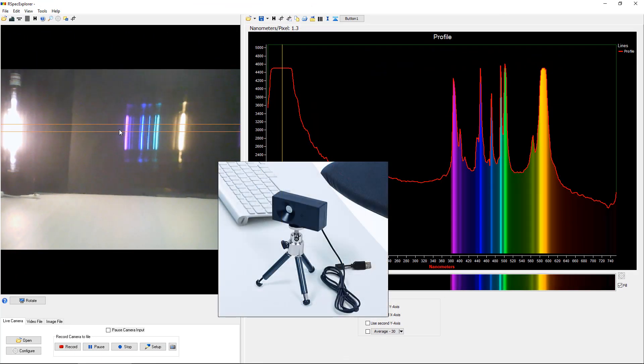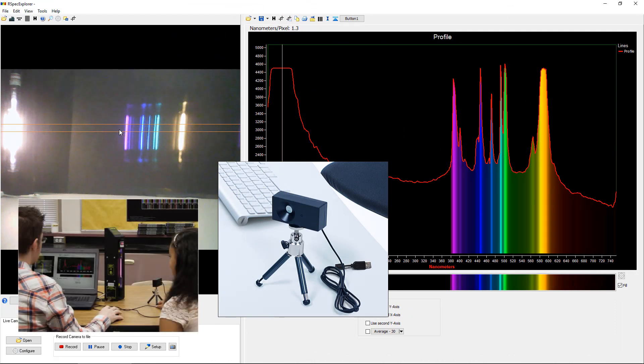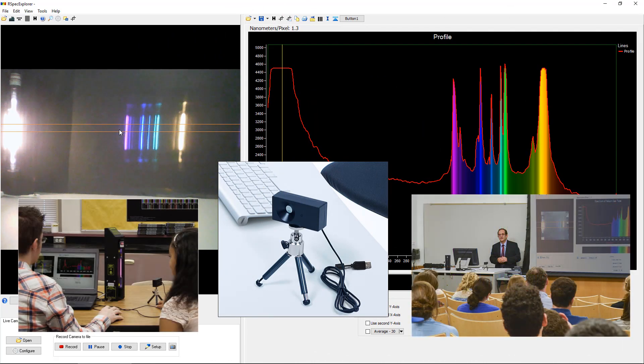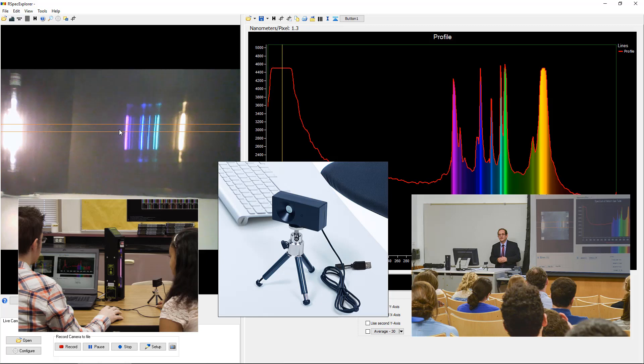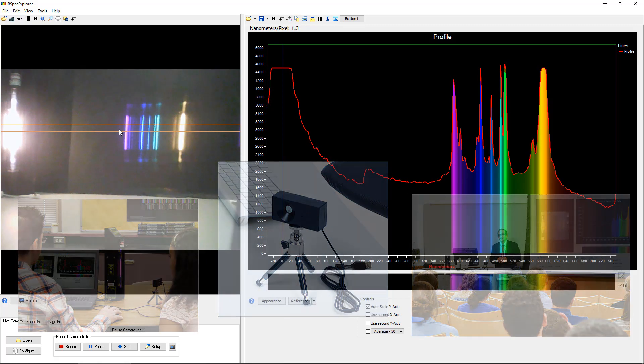So that's a quick overview of RSpec Explorer. Whether you're using it for student labs or for classroom demos, we hope you can see that it will really enhance your students' understanding of the field of spectroscopy.